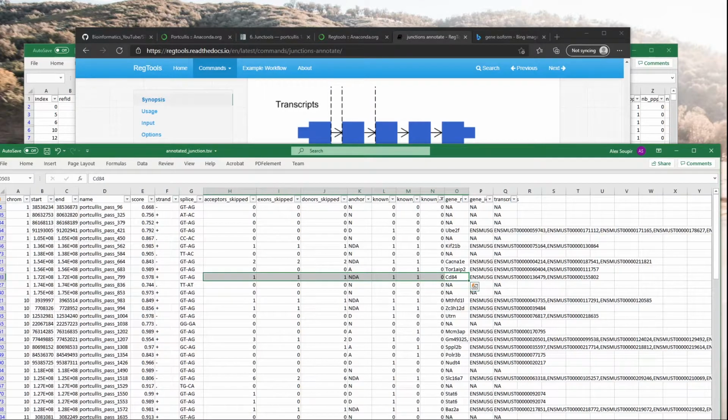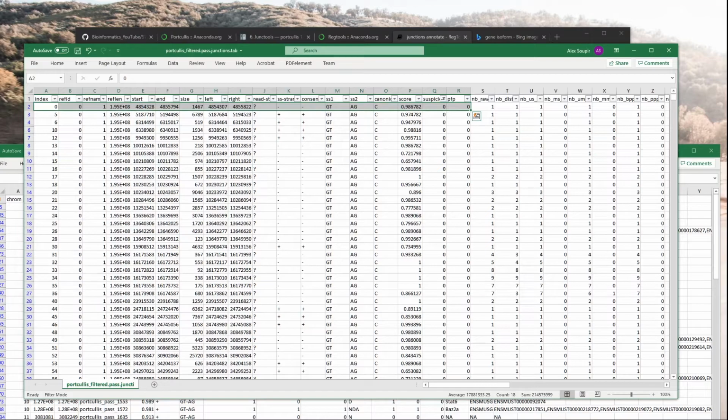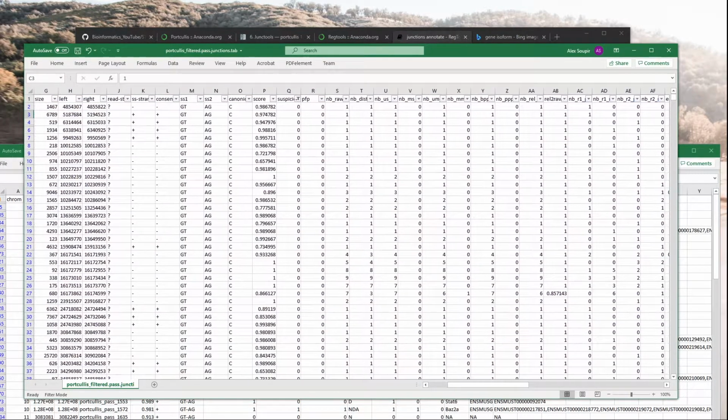to whatever the treatment was for the SRR2121770 mouse? Is this an irradiated mouse? And if so, could this be something that is then related between all of the irradiated mice? And to do that, what you would want to look at is you could have this be your sample name and merge all of your junctions. So you have your start, end, your chromosome. Merge all of your junctions together based on your unique mapping reads.